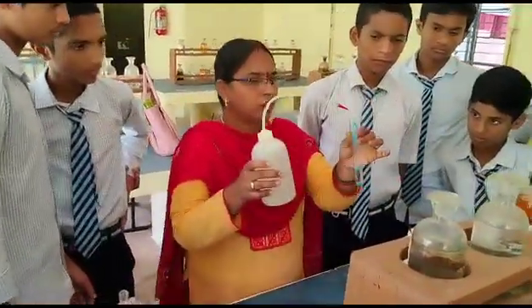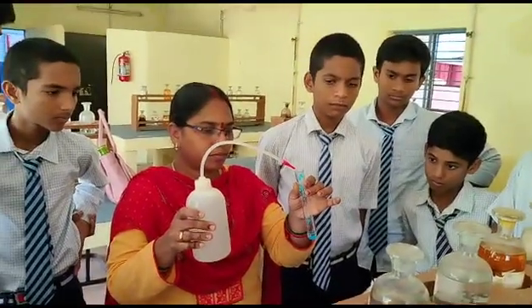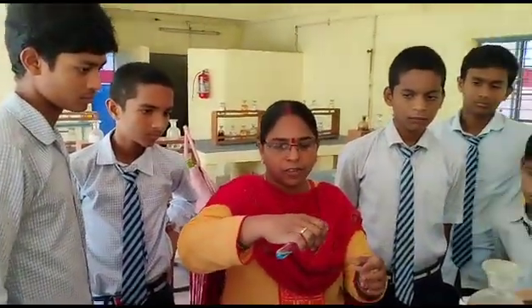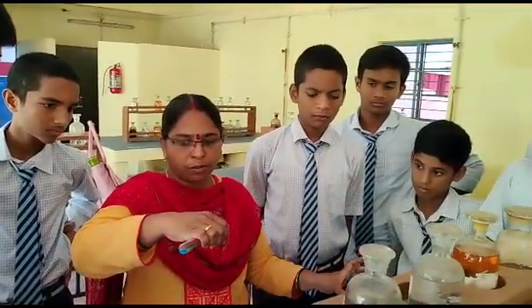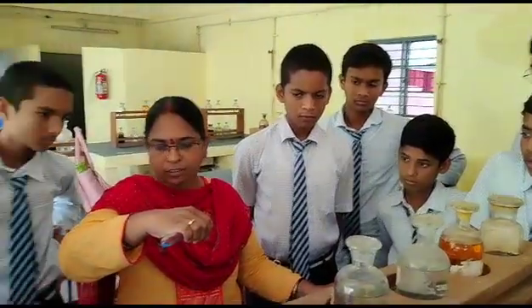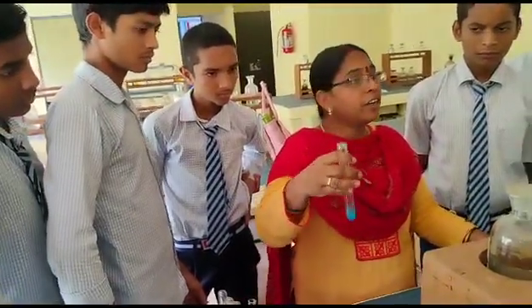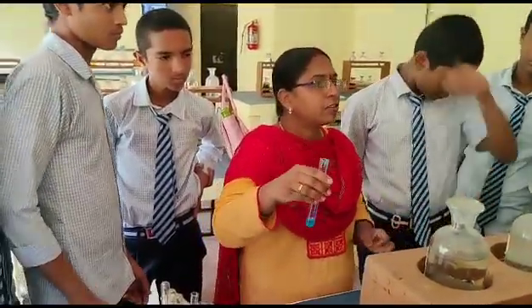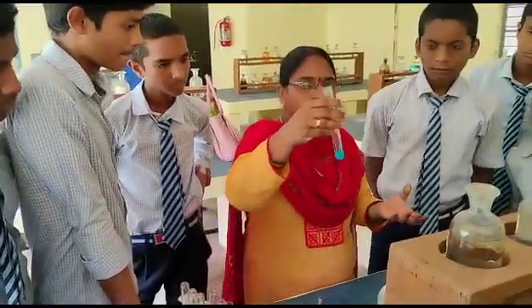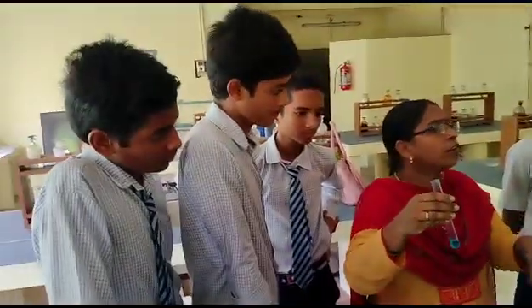So copper sulfate I have taken. This is a test in salt analysis, the sulfate test. Because when you are doing it, you don't know what this salt is. Presently we are discussing like this, but when you are doing salt analysis in 12th class, you have to identify which anion is present: sulfate, chloride, or nitrate. Likewise, you have to identify. So this is a test for sulfate. Once you identify sulfate, then you have to confirm.